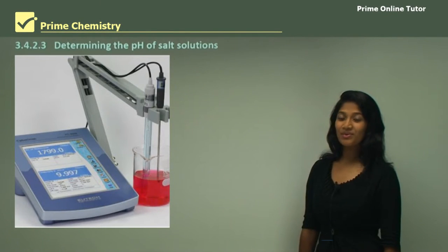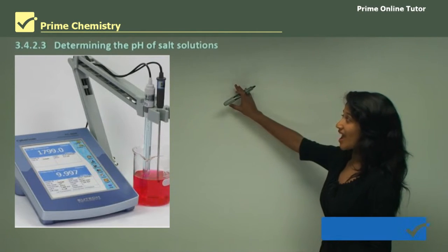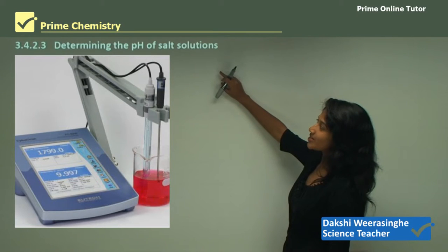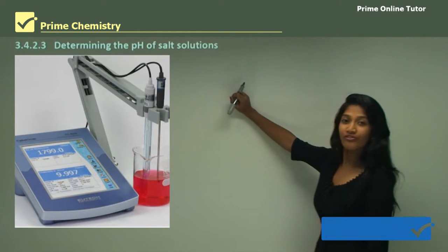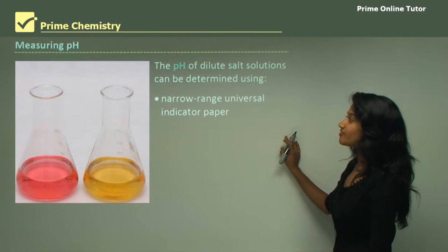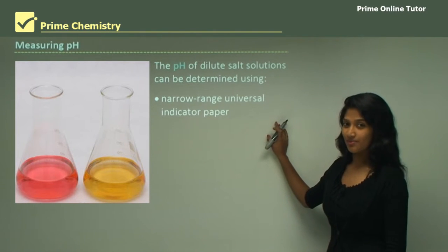Hi everyone, today we'll be learning about the pH of salts. In other words, we'll be doing an experiment to determine the pH of a salt solution. So let's get started. We're going to first see methods of measuring the pH.